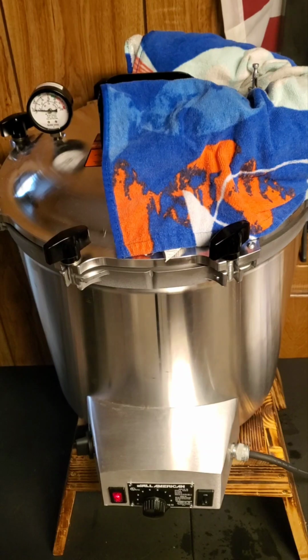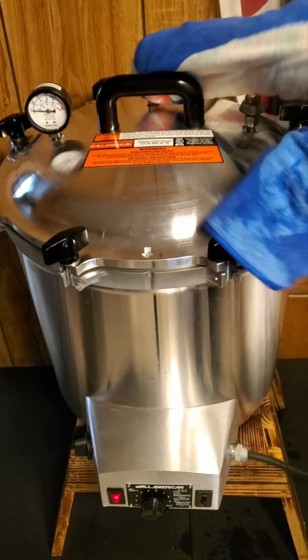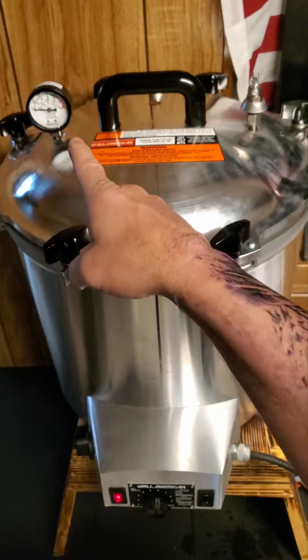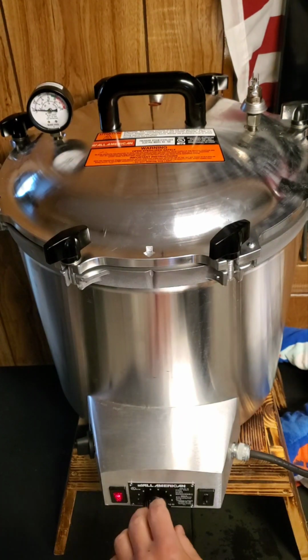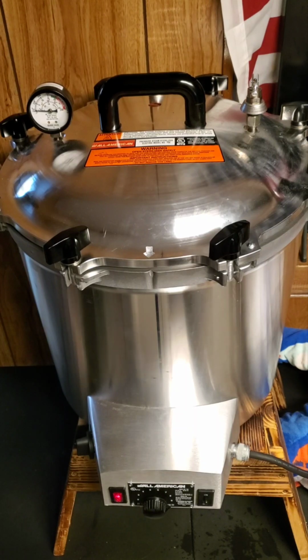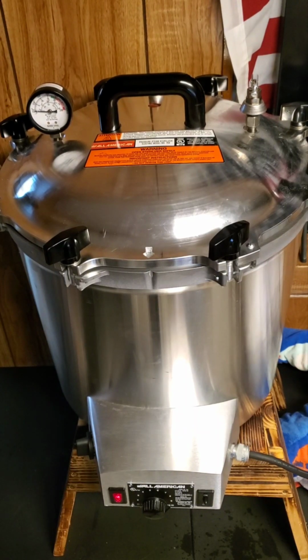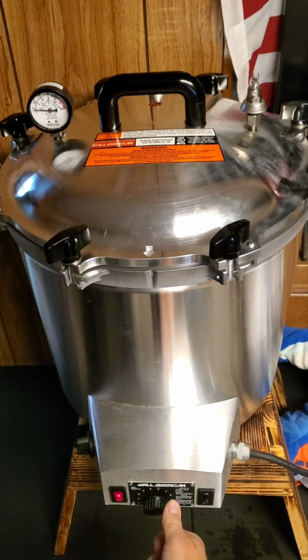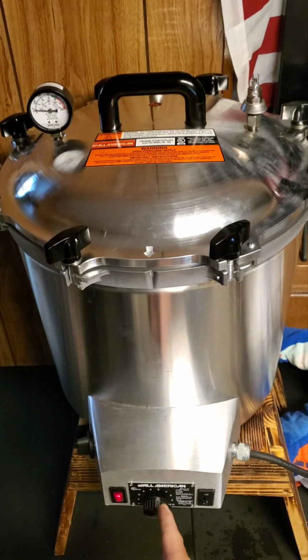All right, now we're just gonna flip that down. It's closed, use the towel to do that. You'll leave it on 10 till it comes up pretty close to 15 in pressure, and then we'll turn it down to 3.5 here, and we'll let it set. So I'm sitting down here behind it at the computer, so I'm gonna be keeping an eye on it, not going anywhere, just if you're wondering. I'll be back when it's time, and I'll show you me turning it down, and we'll watch it pop on and off for a second.